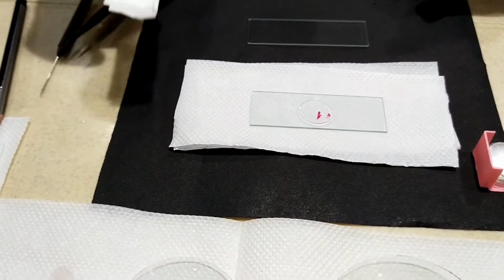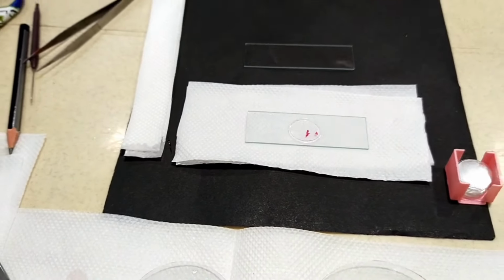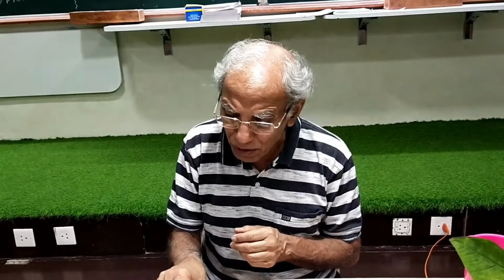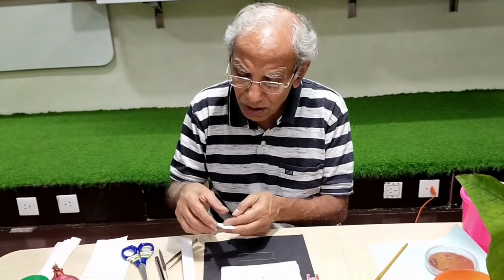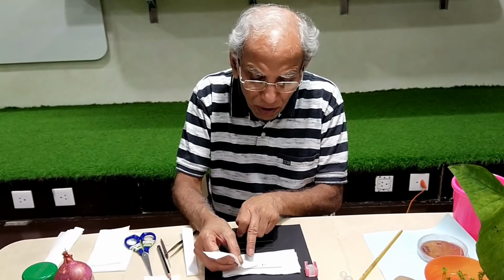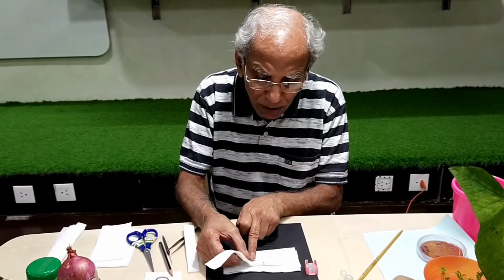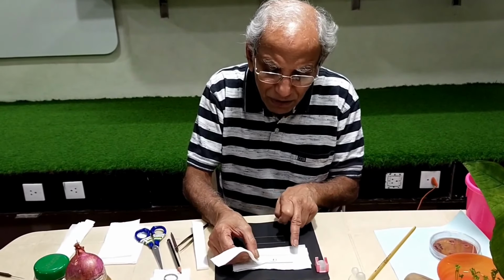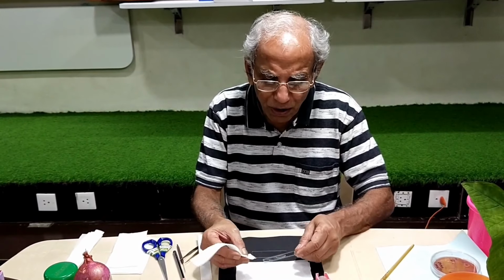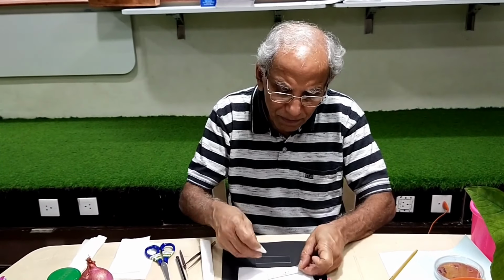You know what is important for biological work is cleanliness. If the cleanliness is there, then the material that you are likely to observe will be seen in a definitely good way, because there should not be a mess. Slide making becomes an art, and you have to do it in a very delicate manner.